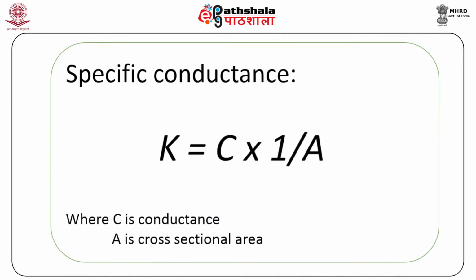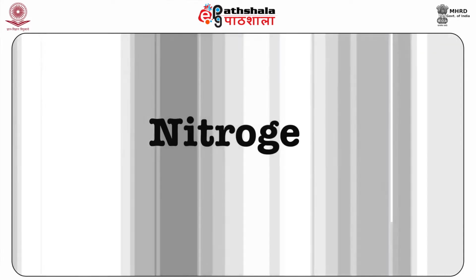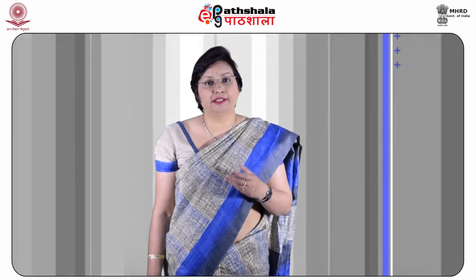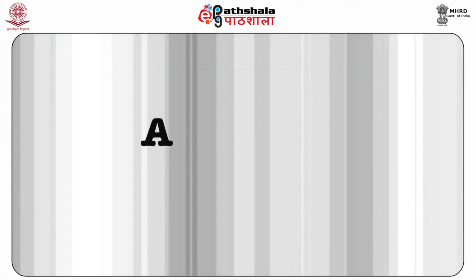Specific conductance is given by, as you can see here, C into 1 upon A, where C is the conductance and A is the cross sectional area. Let us see how the nitrogen in different forms is there in these samples, and then how it can be estimated. First of all, let us consider ammonia.